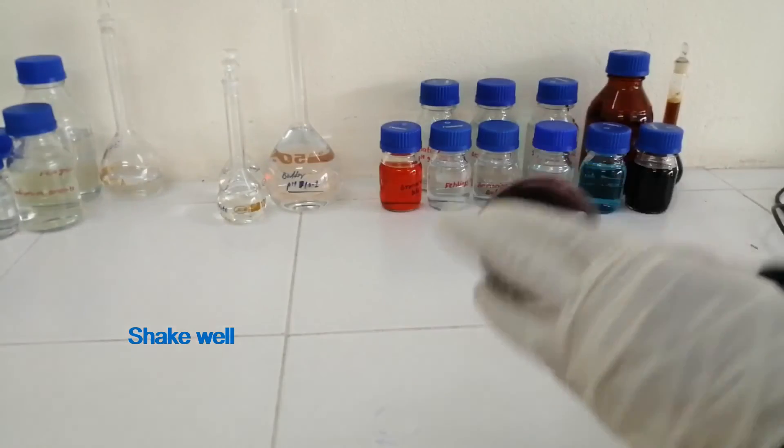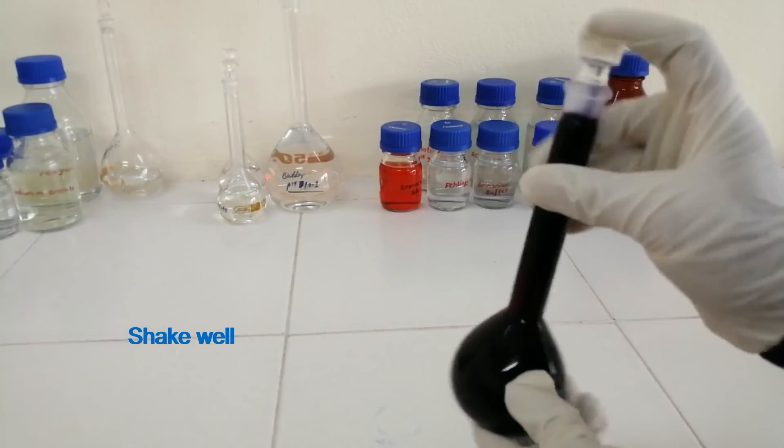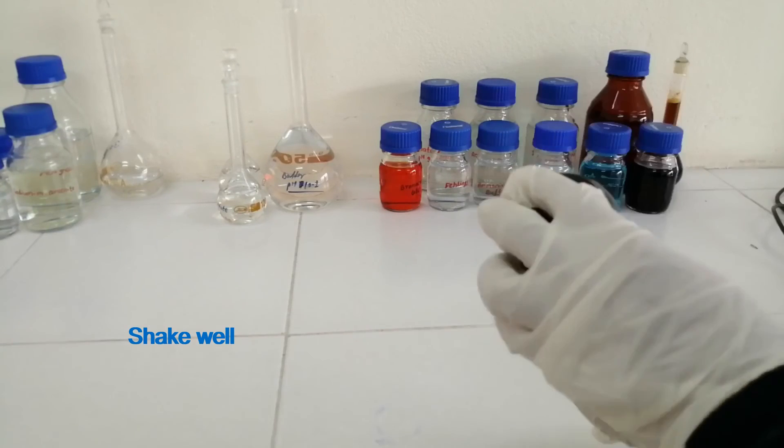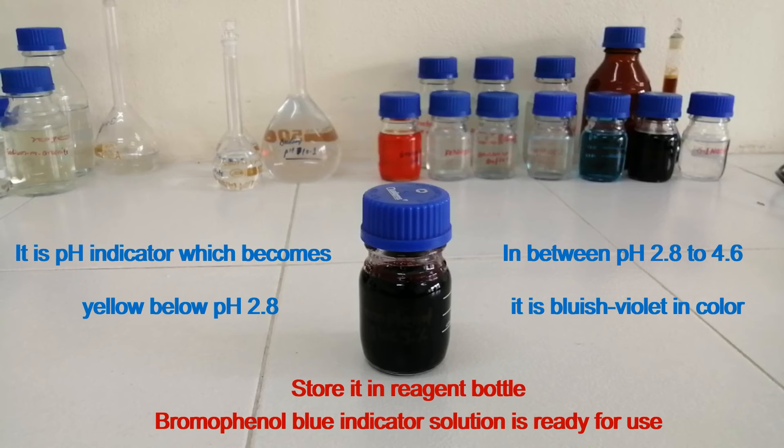Shake well. Store it in a reagent bottle.